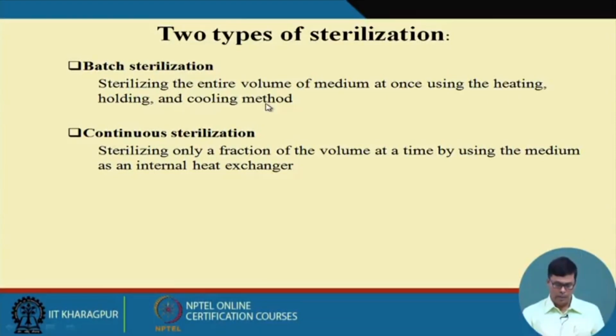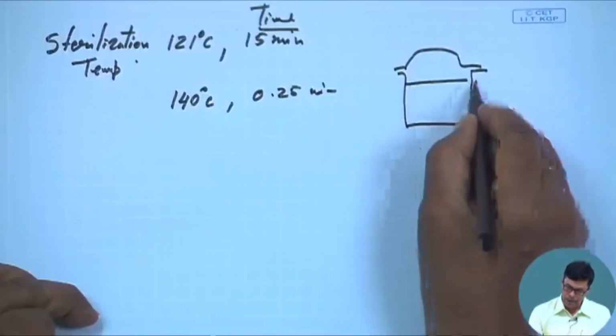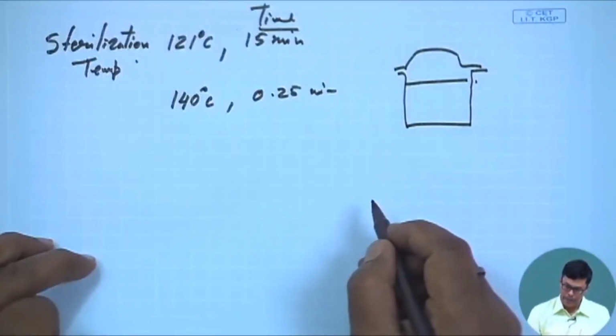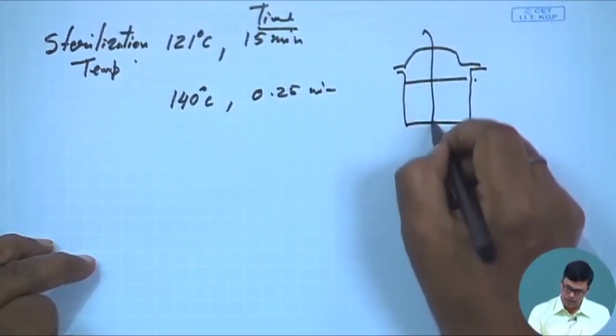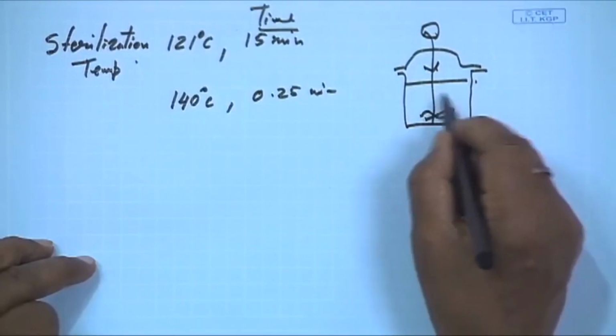So what does it mean? Suppose this is the fermenter, and you have media. Now you want to sterilize this media.